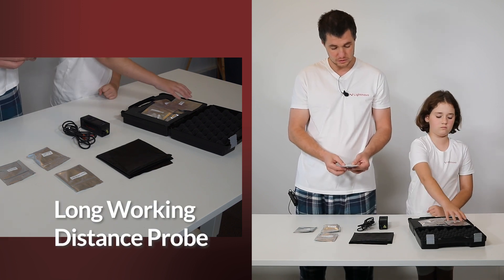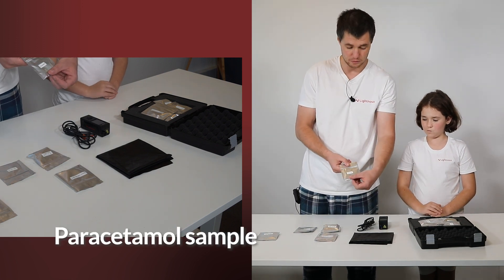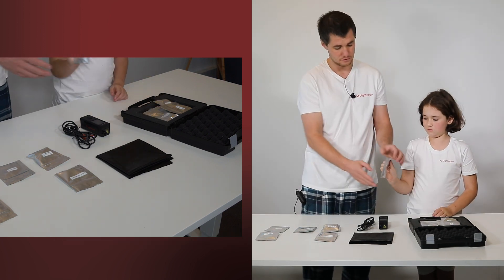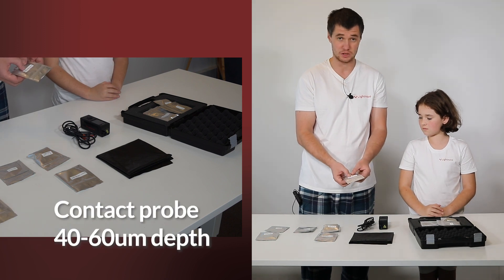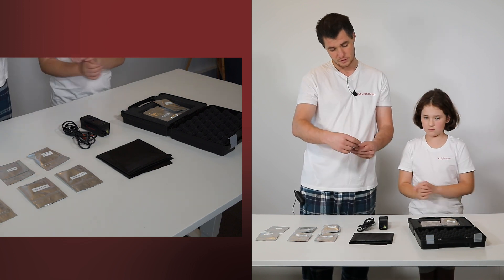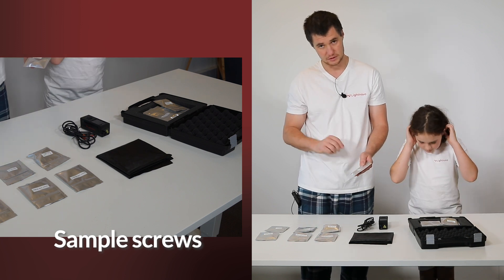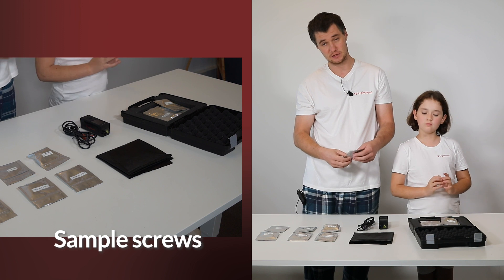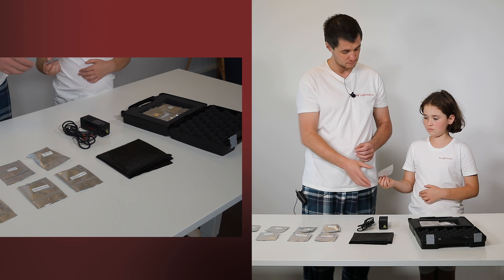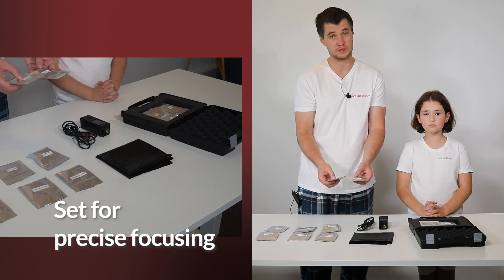Long working distance probe. Paracetamol sample so you can test the Miniraman performance. Contact probe with penetration depth 40 to 60 microns. Sample screws — those are the screws which you can use to press the powder, and using the precise focusing accessory you can then find the best distance and measure a high quality Raman spectrum. A set for precise focusing basically comes together with the sample screws.